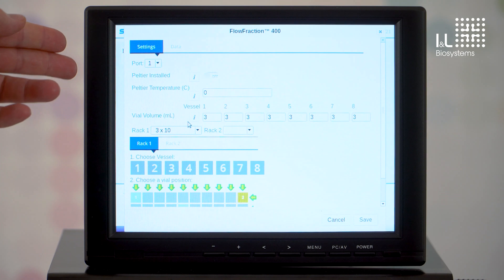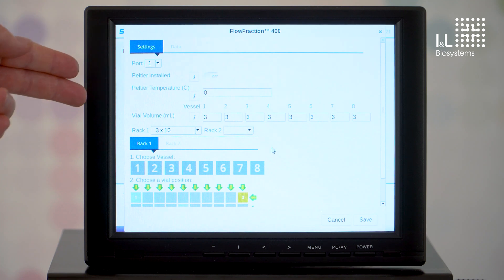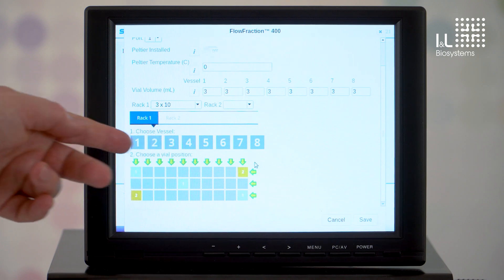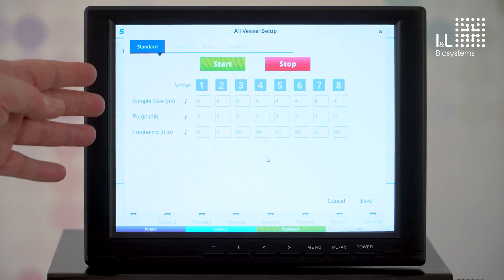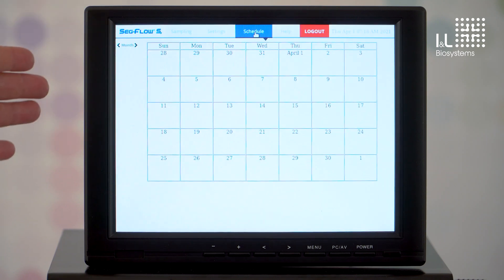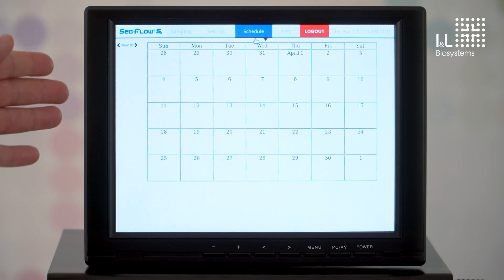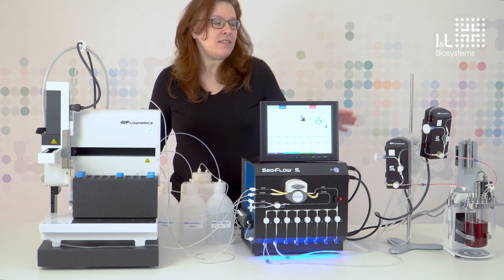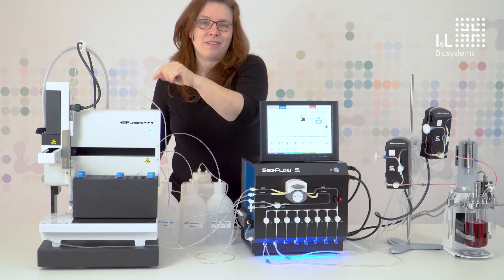In the flow fraction menu, you can select how much sample is to be filled, which rack is used, and finally, after the sampling has been completed, you can see at which positions fillings have been made by the system. Here we would start a trial run and stop it again. In the scheduler menu, we can set the date and time the sampling should start and stop again. Finally, let's start a sampling and look at how this red-colored liquid will be filled here at some point. Have fun!